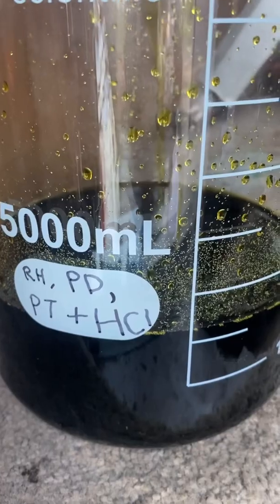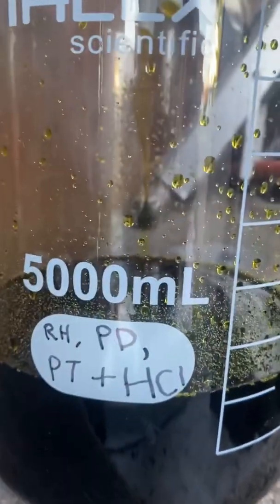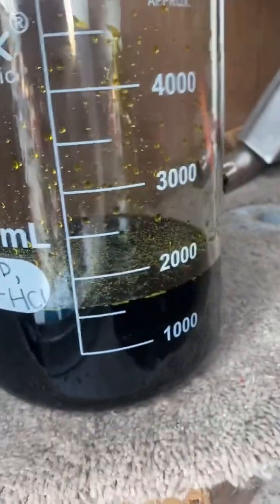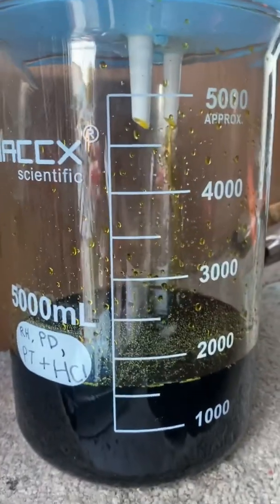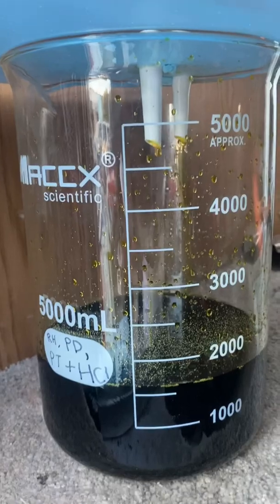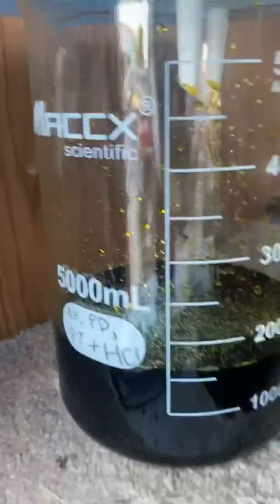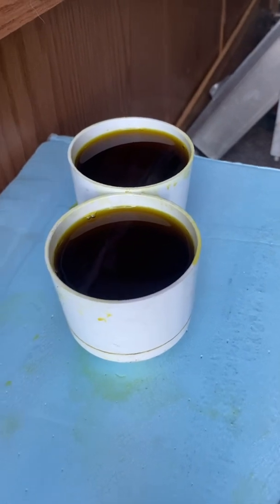See, it is dripping in there. So we'll get this bad boy filled up. We should have halfway — 2,000 — we should have about 4,000 milliliters, I'm guessing at least. We'll see. Going slow — we'll be back.